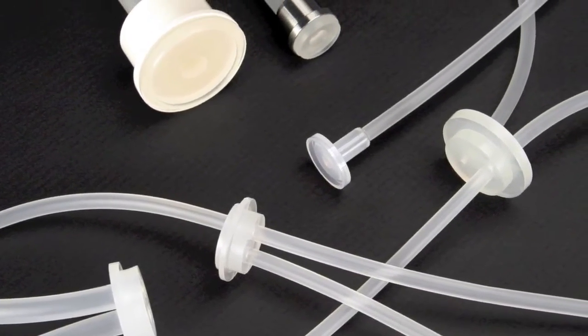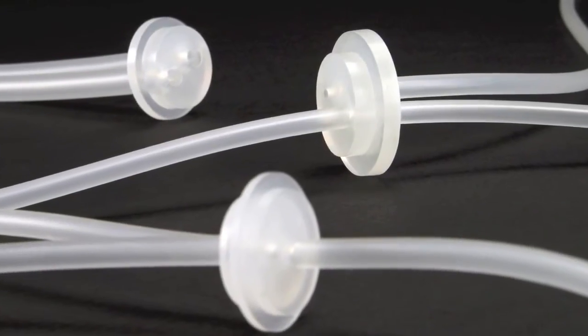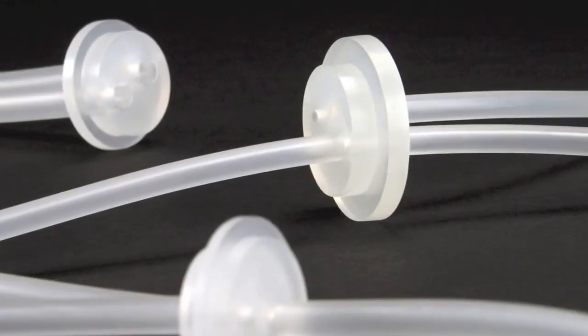Advantipure's bio-closure container closures may also be molded from Advantiflex TPE. Two- and three-tier caps are available, as well as mini and standard tri-clamps.